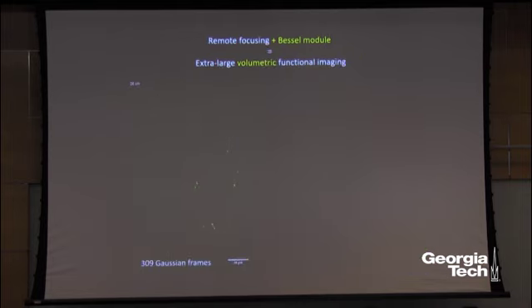One other thing that this method has been super nice for is that it allows us to look at all the dendritic input onto a single neuron simultaneously. Here is just a conventional image movie of a cell body. This neuron has a cell body at around 600 micron, and it sends its dendritic tree all the way to the surface of the sample.